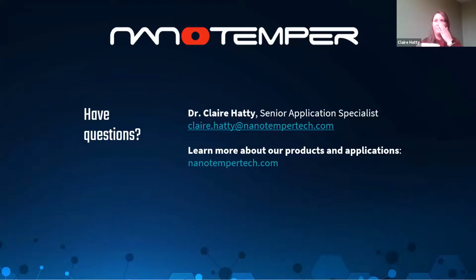Generally, there are different ways that you would potentially prepare the cell lysate, but you want to get it to a fairly homogeneous form and solubilized. If you were doing something with a membrane protein, you'd want to have detergent in there as well to solubilize the membranes a bit. We have some protocols on our website for how various people have done it, but basically preparing your lysate, maybe doing some enrichment steps, so not quite purification, but you get the debris out or whatever.